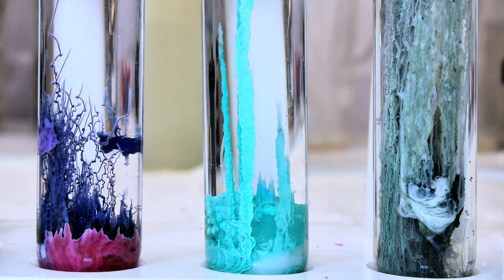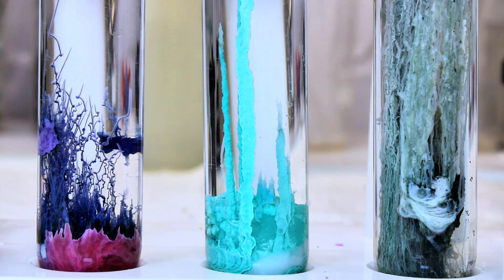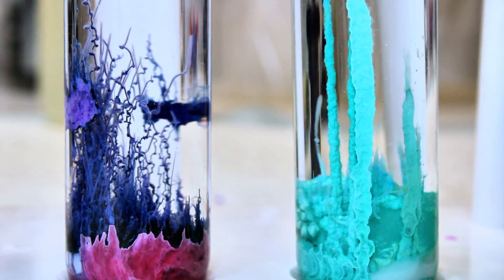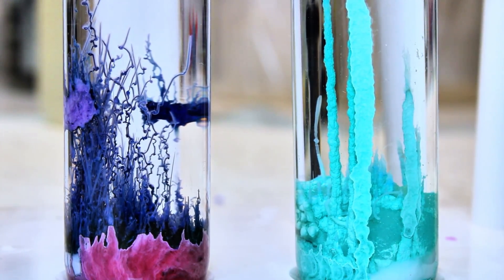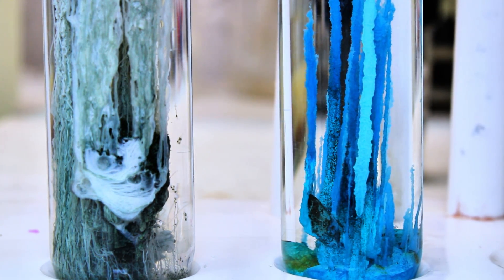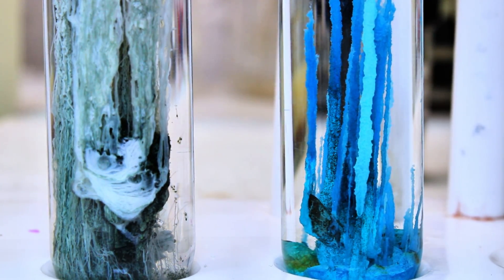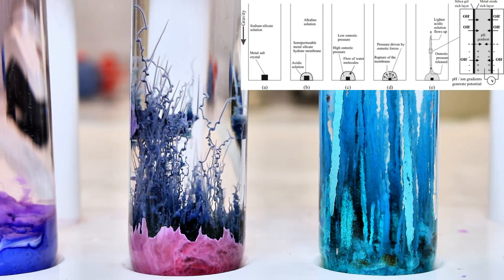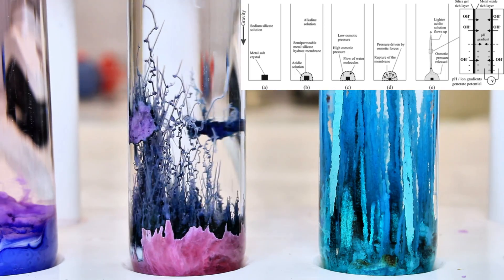The reason metal stalactites form in the sodium silicate solution is because as soon as the soluble salt is immersed in solution, it slowly begins to dissolve. However, as soon as it does, it'll instantly react with the silicate in the solution to form an insoluble silicate mineral shell. The result is upward and potentially outward growth that eventually begins to look biological, and thus a chemical garden.